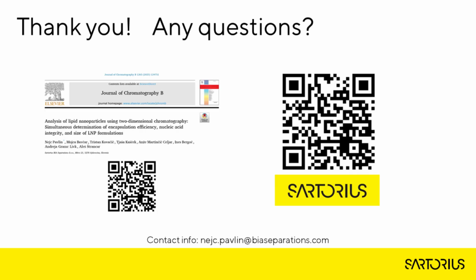The SDVB column is really strongly hydrophobic, and this strong hydrophobicity of the column really attracts the lipids which are on the outer side of the particle so much that the particle is just deformed, and in this way we assume that the payload is released from the particles, and this enables us to further analyze the encapsulated cargo at the end.